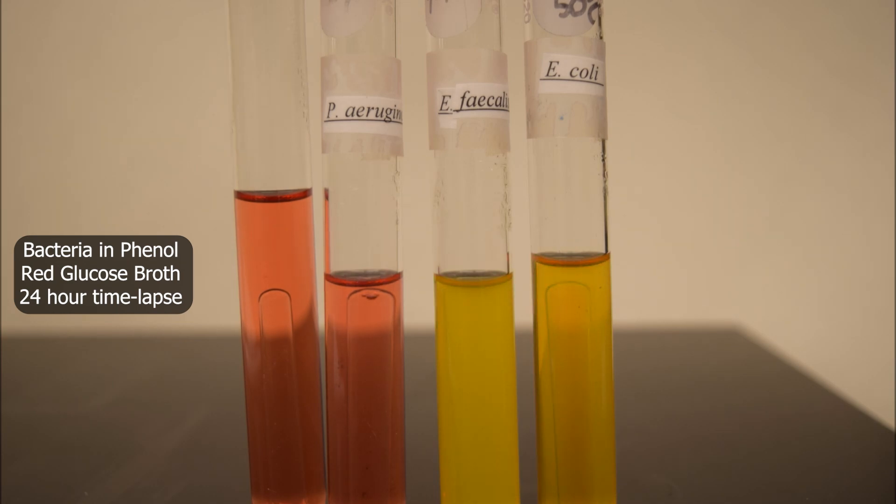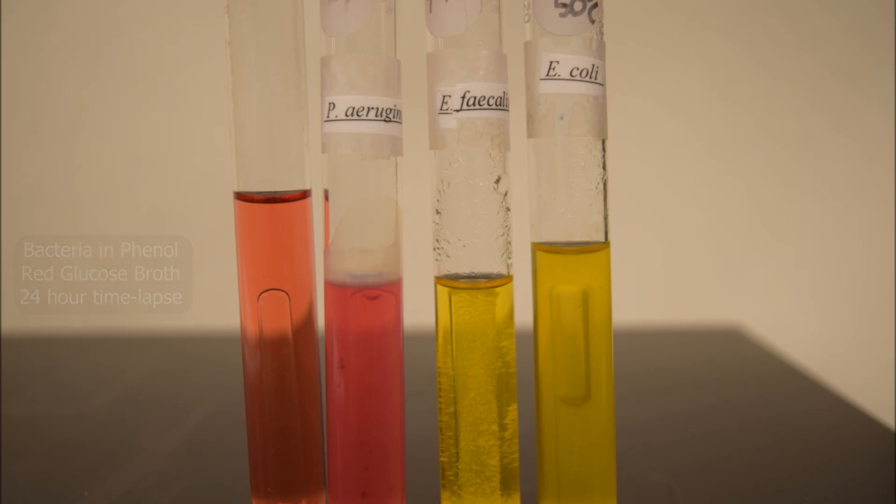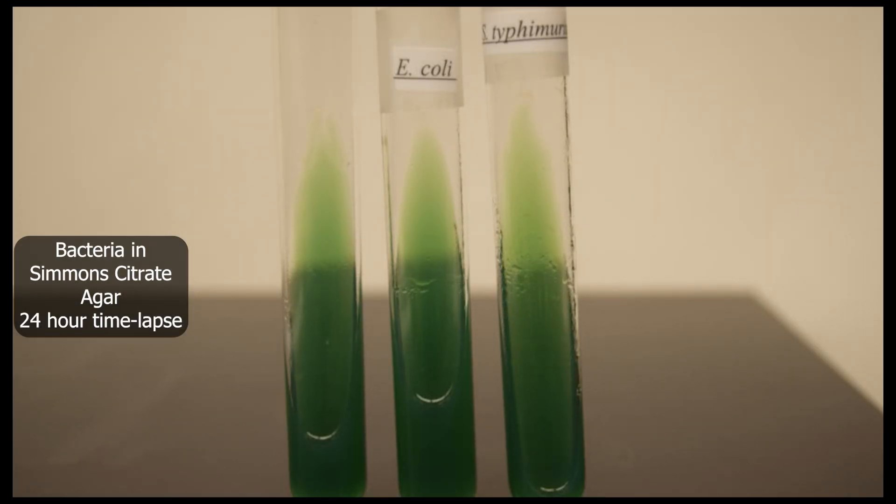You can see bacteria growing, producing gas and metabolites, and changing the pH of the media, which in turn changes the color of the media. That is because there are chemicals called pH indicators that will change colors when the pH changes.